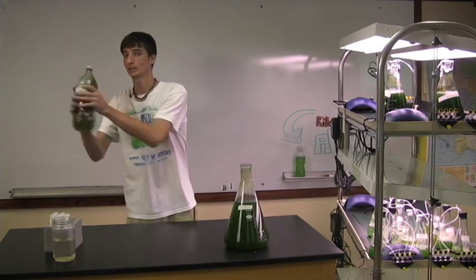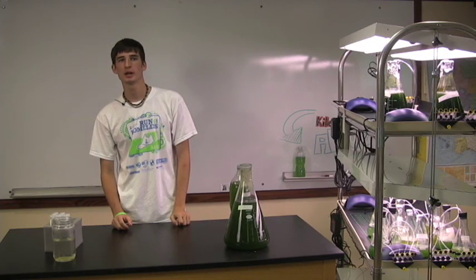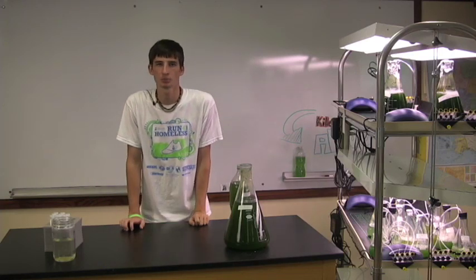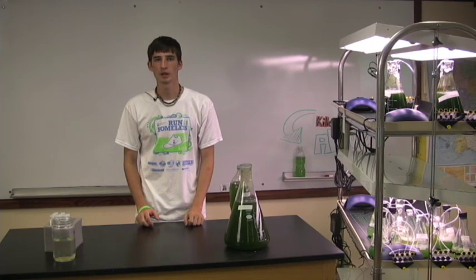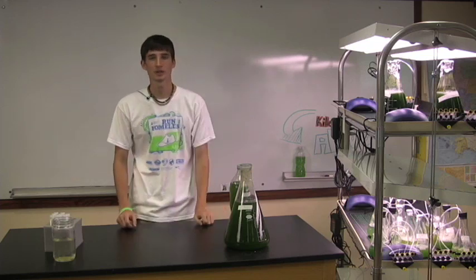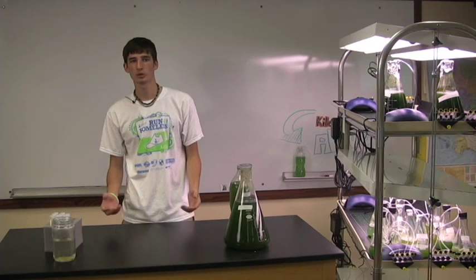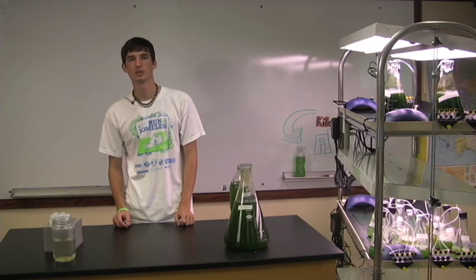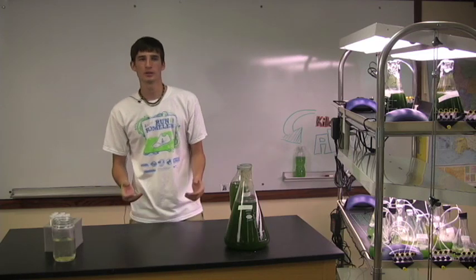In order to grow algae, you need algae. For our lab, we purchased specific species from a private culture collection chosen based on our prior research. We tested four non-filamentous freshwater species from Carolina Biological Supply Company and collected various pond samples. The advantage of ordering monocultures from Carolina is that you know what you have and contamination should be pretty low, but they do cost money.